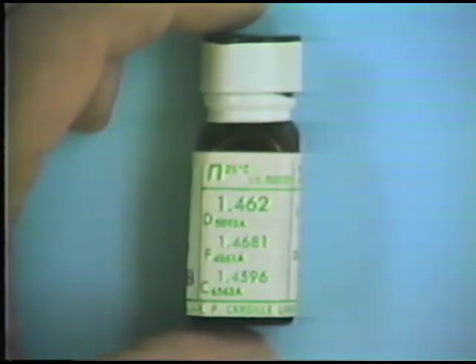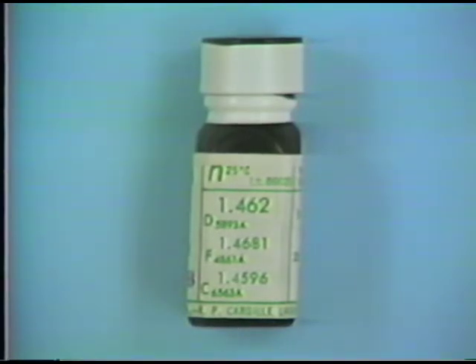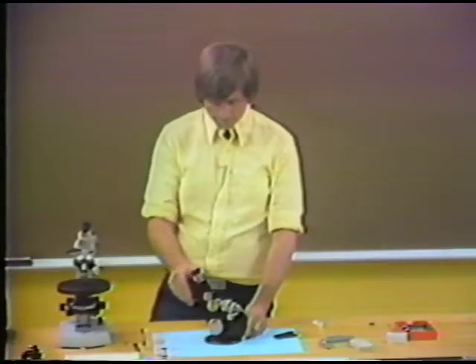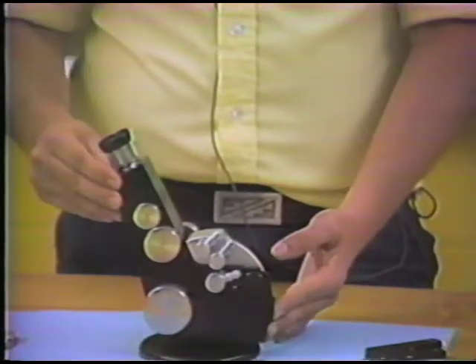Now we can actually measure the index of refraction of an immersion liquid in the laboratory. To do this, we use a device called an Abbe refractometer, which I have right here. This is what the Abbe looks like. It looks a little bit like a microscope.